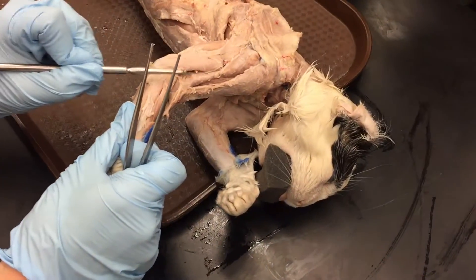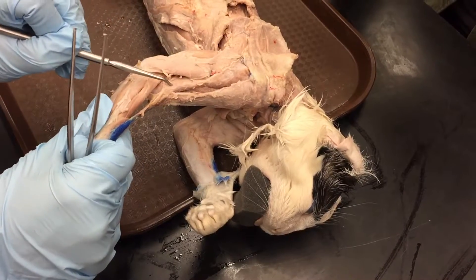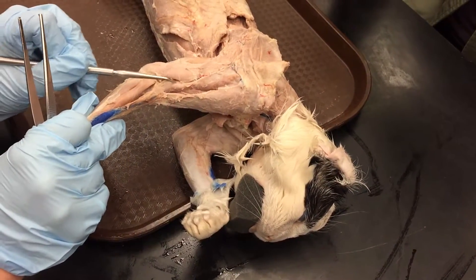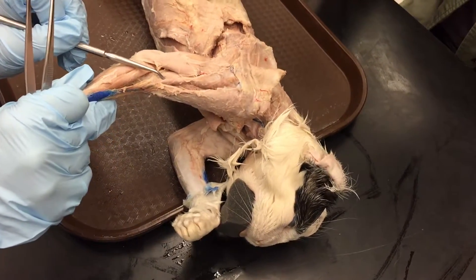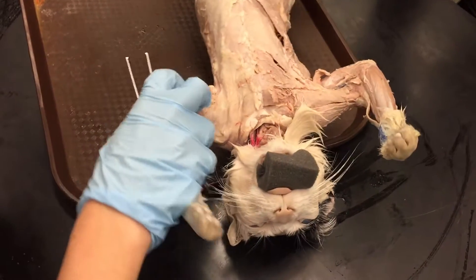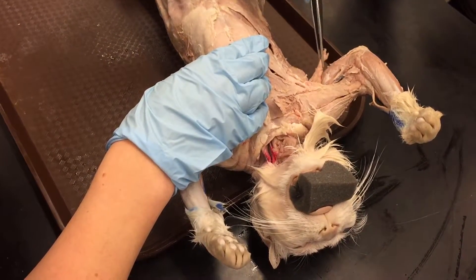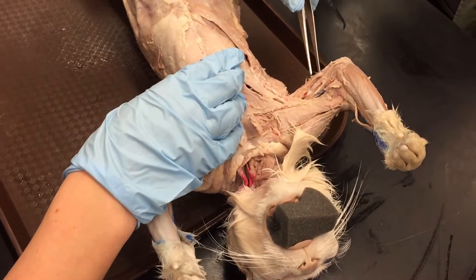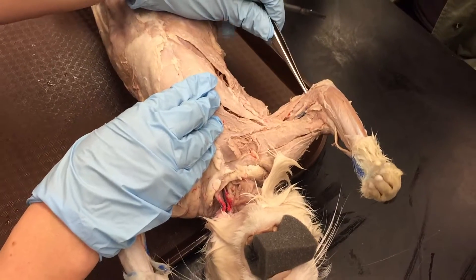The next one is the brachialis, which is this muscle here. It's basically — if you find your acromiodeltoid, just think of the extension towards the elbow of this muscle. So: brachialis, acromiodeltoid, brachialis. And then the epitrochlearis is the one that needs attention — it's this thin muscle covering the long tricep. It's not the best on all the cats we have here, but it's just this thin muscle that covers the long tricep.